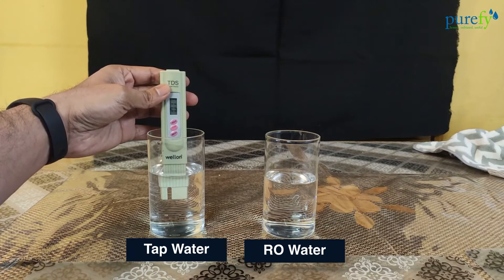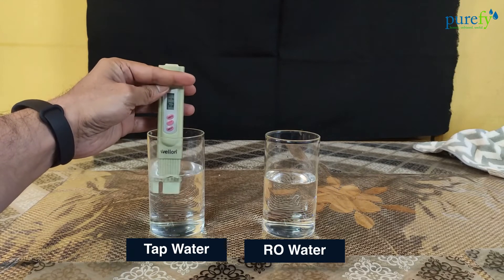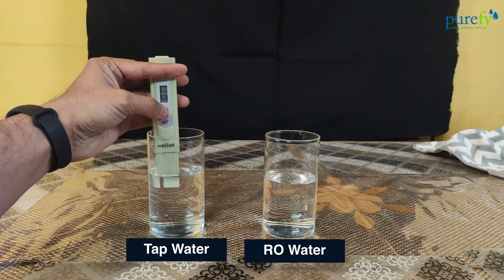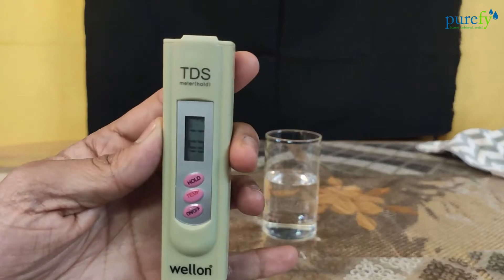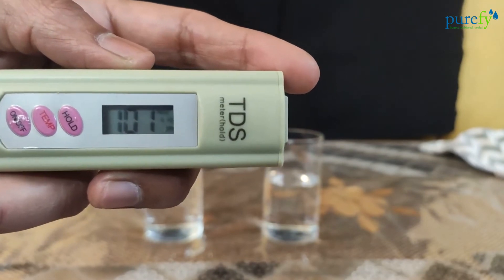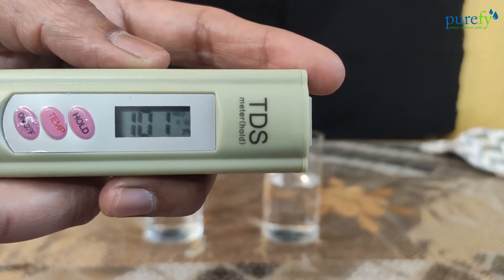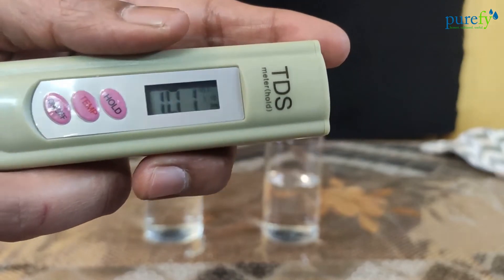Wait for the reading to stabilize. Once the reading stabilizes, press the hold button so the reading does not disappear when you take the TDS meter out of the water, giving you sufficient time to note it down. The TDS level is measured in ppm — that is parts per million or milligrams per liter. As you can see, the meter shows the reading as 101. If you look carefully, you'll also see X10 written in small font in front of the reading, which means you have to multiply the reading by 10. This X10 symbol appears when the measured TDS level is greater than 999. So the actual TDS level of the tap water is 1010 ppm.